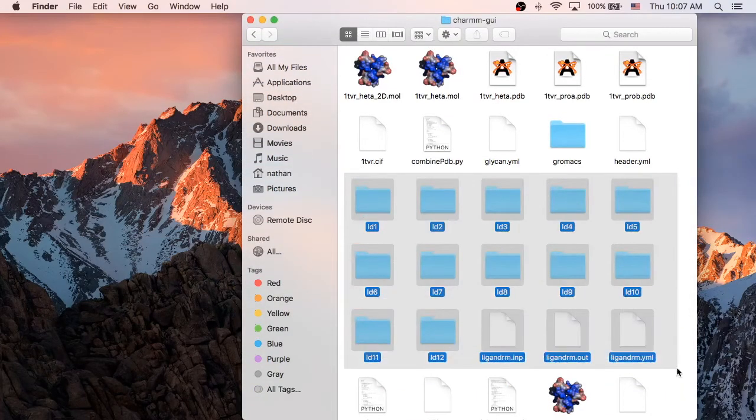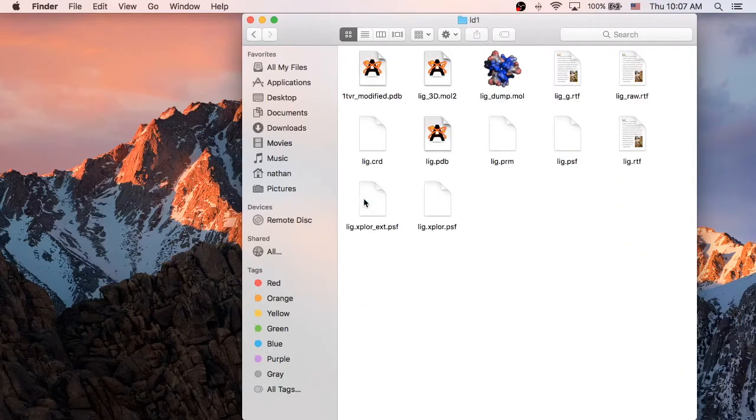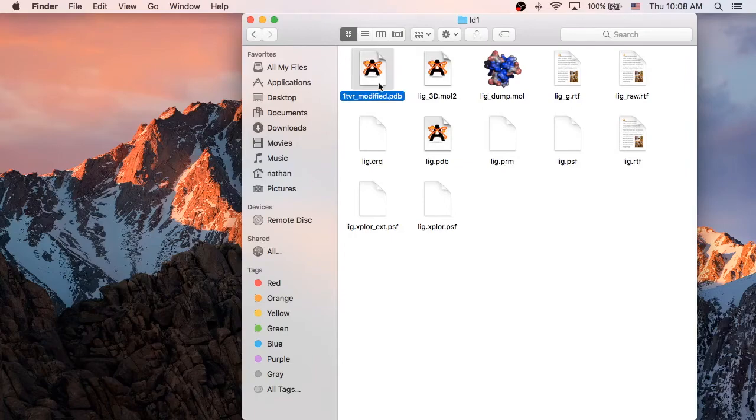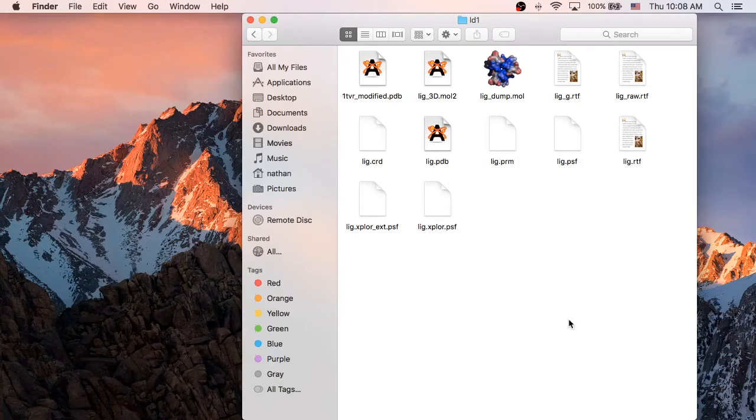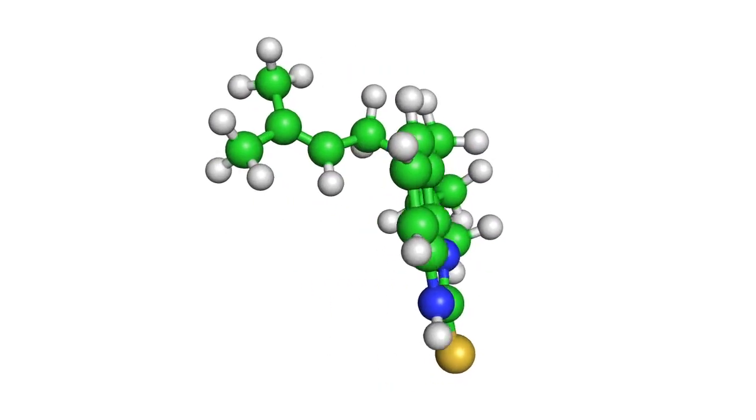Here we can see 12 different ligand folders, with each corresponding to a different combination of replacement groups. The LIGPDB file contains just the ligand. And 1TVR Modified PDB file contains the 1TVR enzyme in complex with our modified ligand.